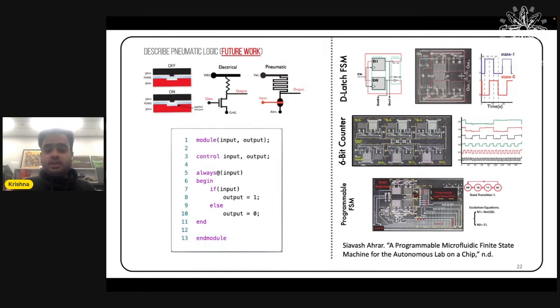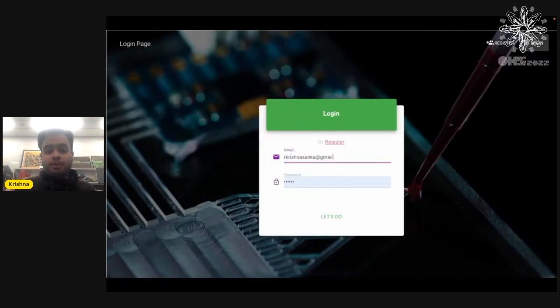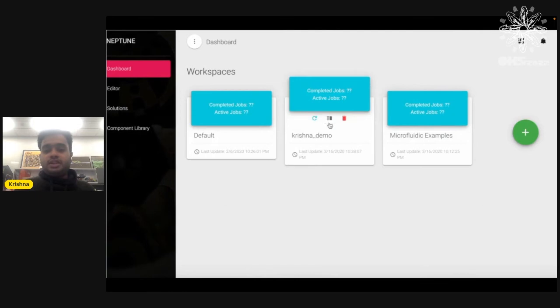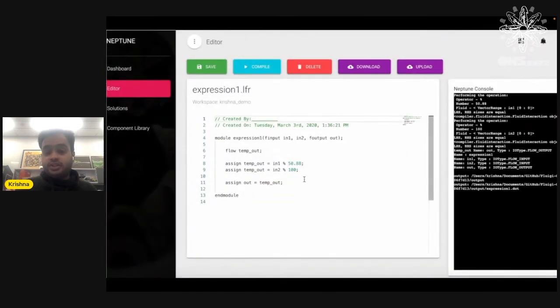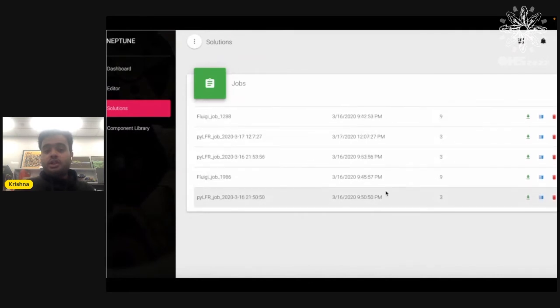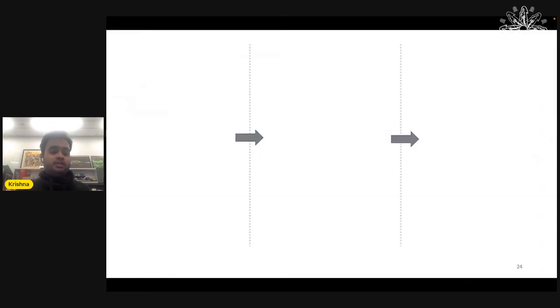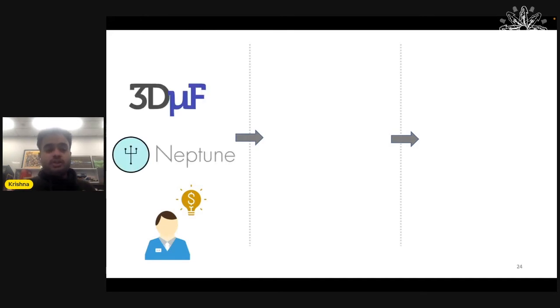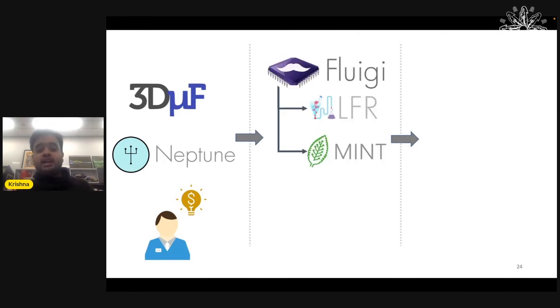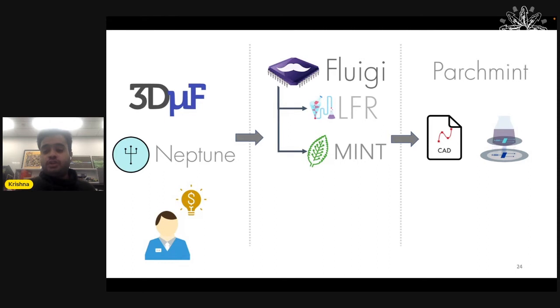With this entire ecosystem — the design language, compilers, and the manufacturing library in 3DUF — I created another tool called Neptune: a cloud-based IDE so that microfluidics engineers or biologists who aren't super tech-savvy can quickly create a description in LFR and compile the final design outputs. So now if you have an idea for a microfluidic device, you can use one of my design tools — Neptune or 3DUF — and that in turn uses different languages and algorithms to generate the final designs and CAD files needed for manufacturing.